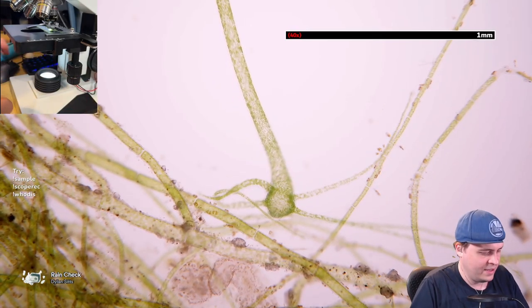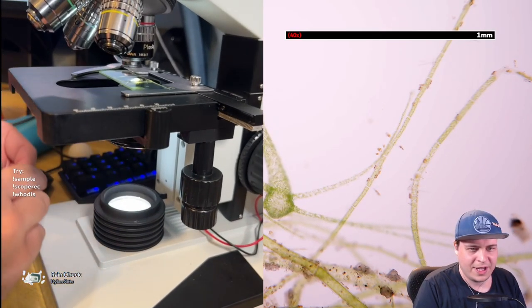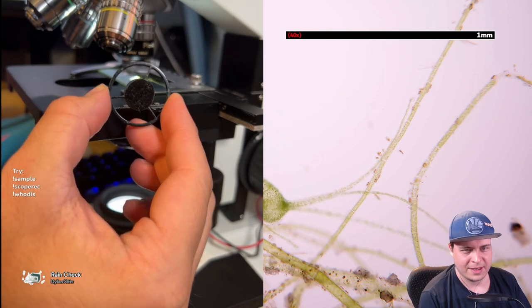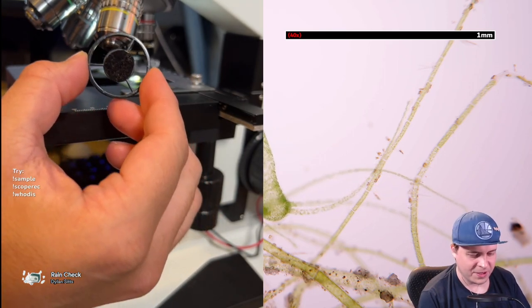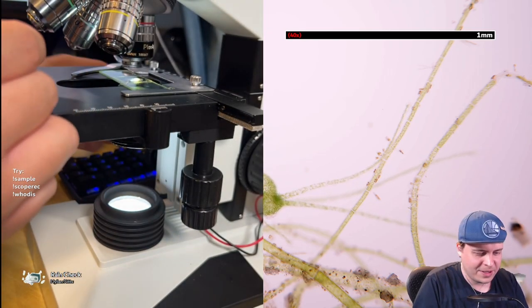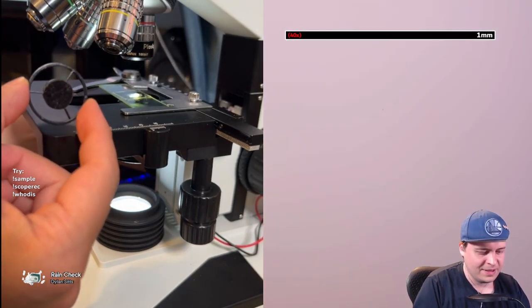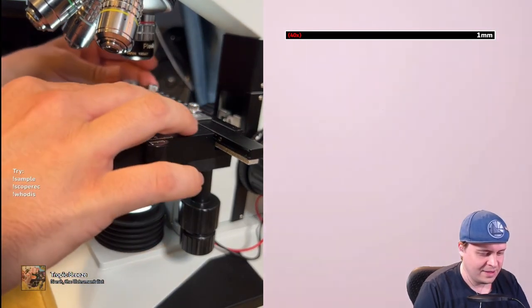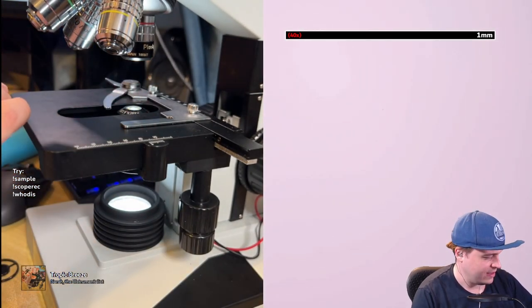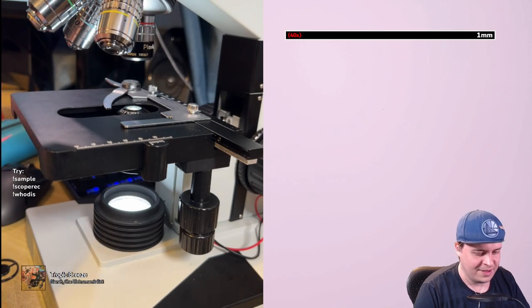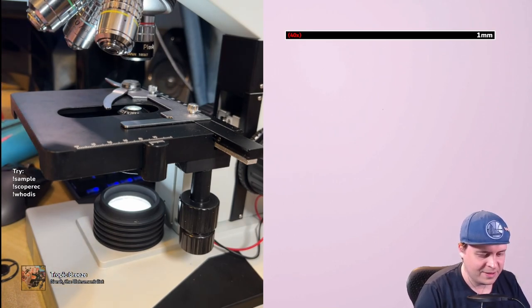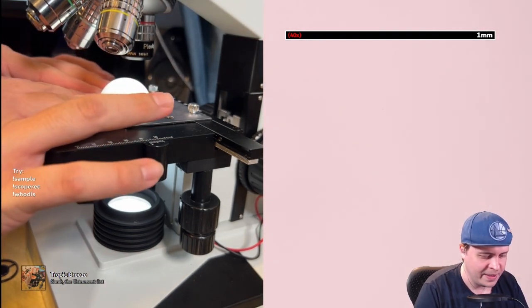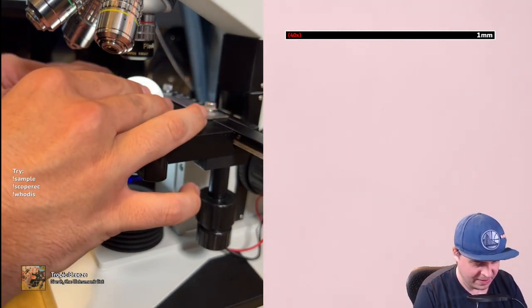Now we're going to change to dark field. Traditionally you use a filter that looks like this, but before we get into it I want to show exactly what this filter is doing. I'm going to take the slide out and use our condenser hemisphere of science — aka half of a ping pong ball — and put it right over the condenser.